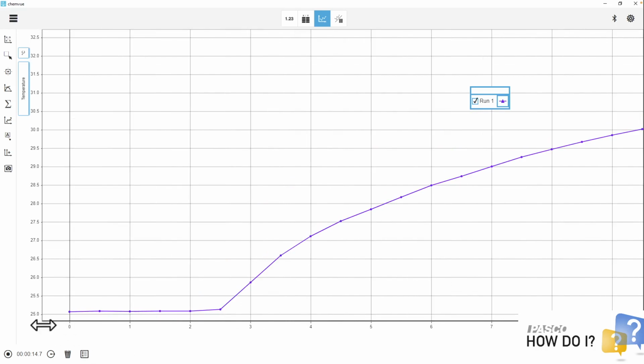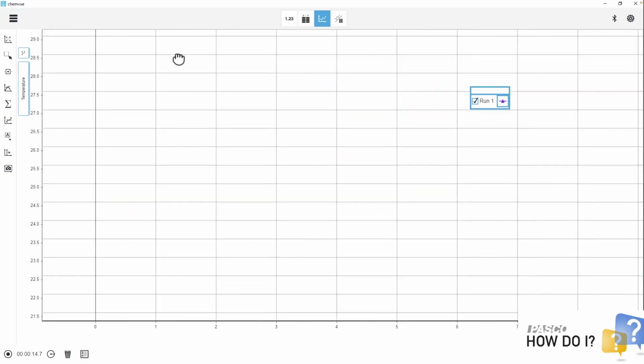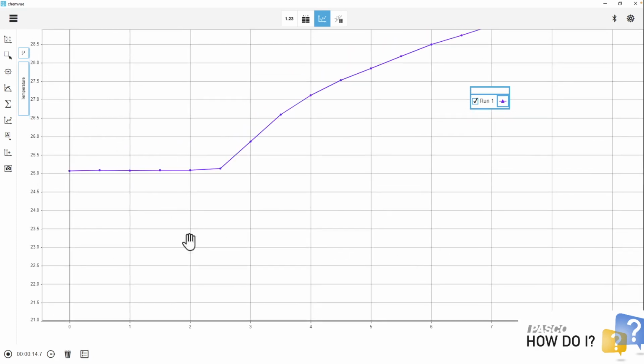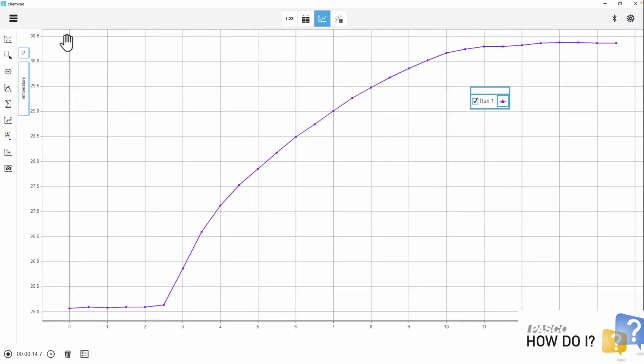And if you need to change the starting point at the bottom of the scale, you can pan. So anywhere where there's no data in the graph area, left click or hold and drag to change the bottommost value as another way to pan and change the scale. If you get lost and your data disappears, you can always hit Scale to Fit.